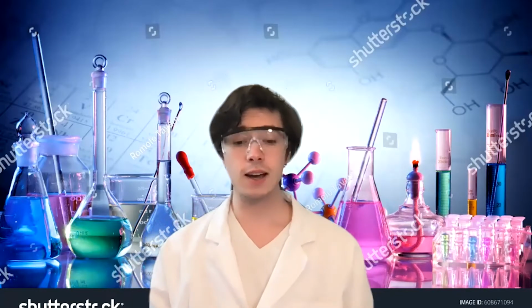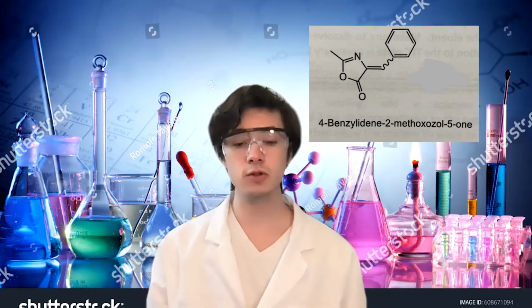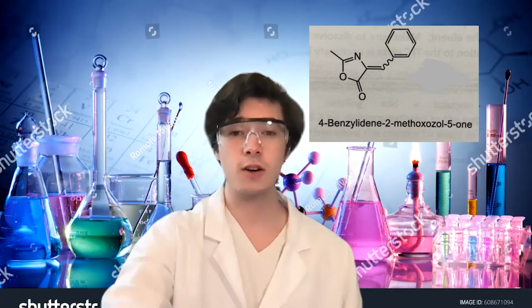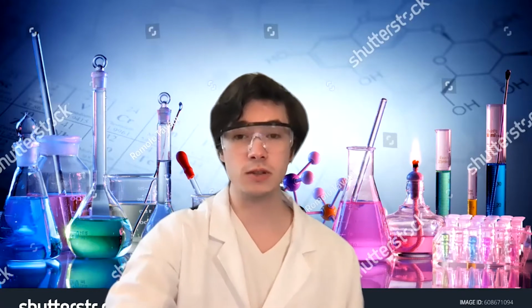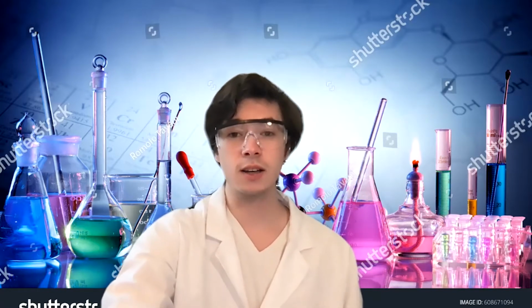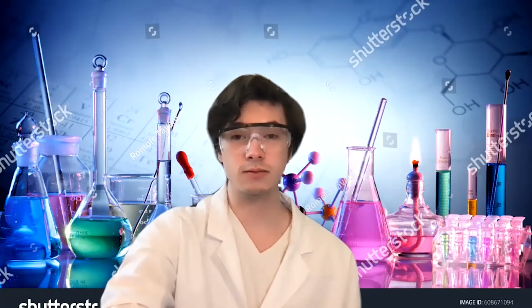Let's take a look at the synthesis reaction of 4-benzylidene-2-methyloxazol-5-one. First, let's calculate the overall percent yield of this multi-step synthesis reaction. This is done by calculating the percent yield of each synthesis step and multiplying them all together.